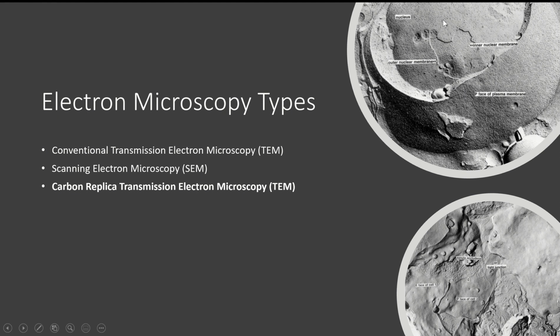And you can see part of it is peeled back, and you can see the cytoplasm of that lymphocyte. This is going to be the nucleus of that lymphocyte, so you can see the surface of the nucleus, the little nuclear pores that are in there. So it just gives you a lot of surface detail, okay? Like I can't see through the cell or anything like that, but it gives you a lot of surface detail. So it's literally like we're making a Play-Doh mold of these cells. We're looking at the Play-Doh, and we're analyzing whatever we see, okay?